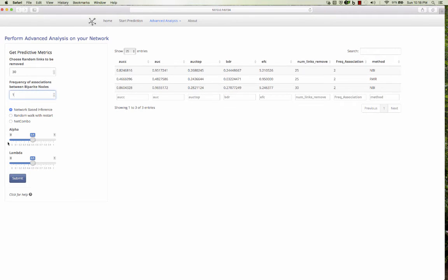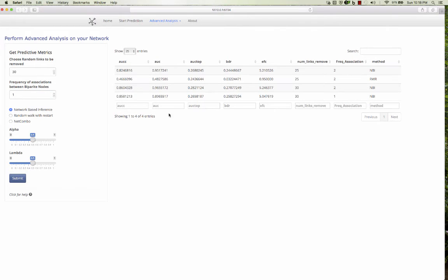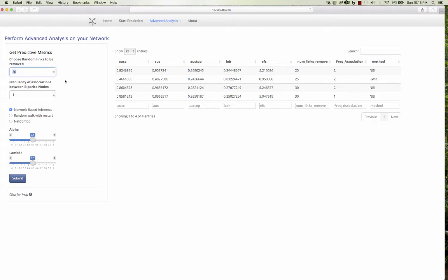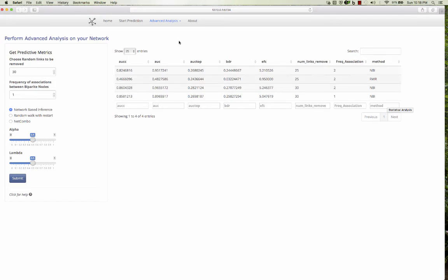You can add and it adds up and shows up here. So this is how this advanced analysis works. So randomly you can remove 30 links and then try to re-predict that, whether those have been predicted or not.